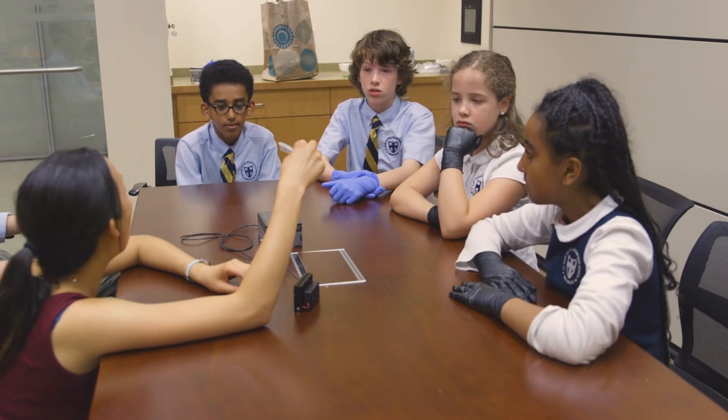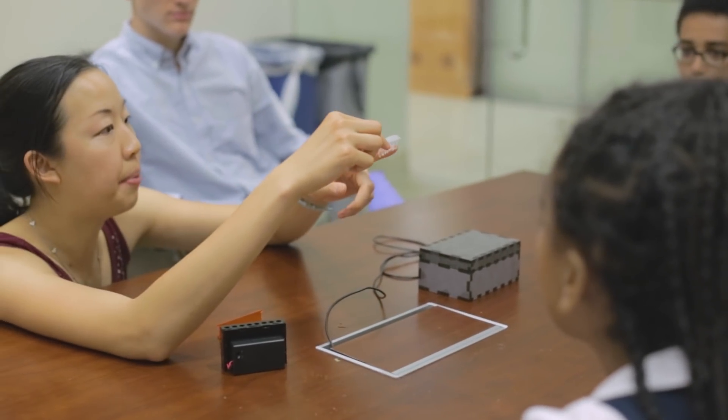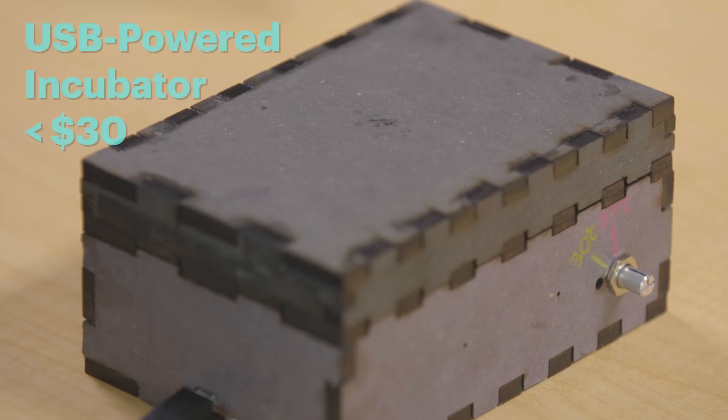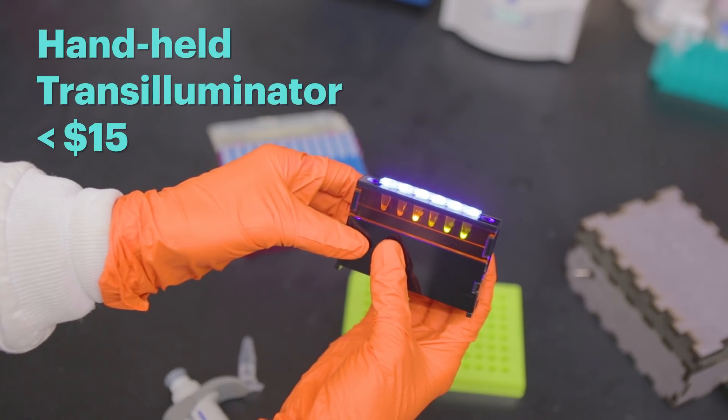One of the things we really set out to do in these BioBits papers — both BioBits Bright and BioBits Explorer — is to change that paradigm by creating essentially low-cost educational kits that could be used in the classroom setting for less than $100. What I did is I took all the machinery we need to build proteins out of the cells and put them into these little tubes, so we can actually make proteins using those little pellets without having to grow E. coli.